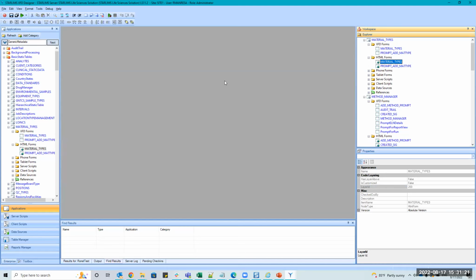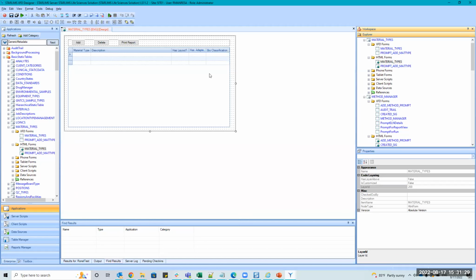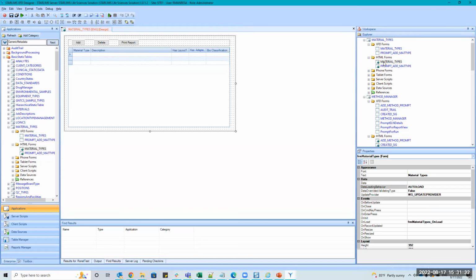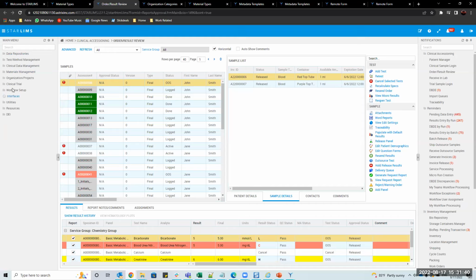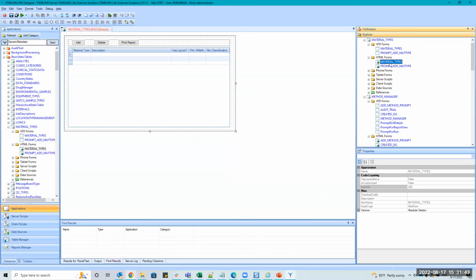And back in the day, if you wanted to change that code, let's say the client asks for something else to be added to these material types, a new column or something, you would have to make a copy, make the changes in that copy, expose that copy, and call the copy something like client underscore material types, the client name. It was a mess and a lot of overhead. Now they have introduced version layers. So now you just have to go in and say customize, and now you've changed it to 300.